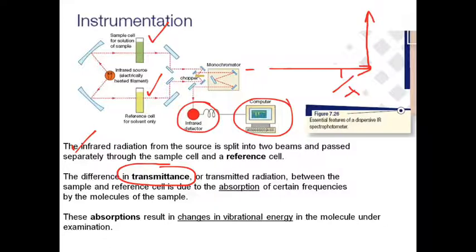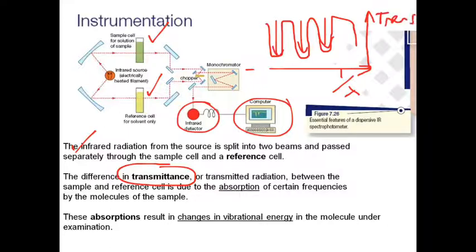So that then, when you're measuring, you get all these peaks. Instead of peaks, they're reverse peaks. They're troughs, and these troughs are actually your transmittance. And the transmittance, when you get a trough, basically corresponds to a peak of absorbance. So these things are peaks of absorbance, which are troughs in transmittance.